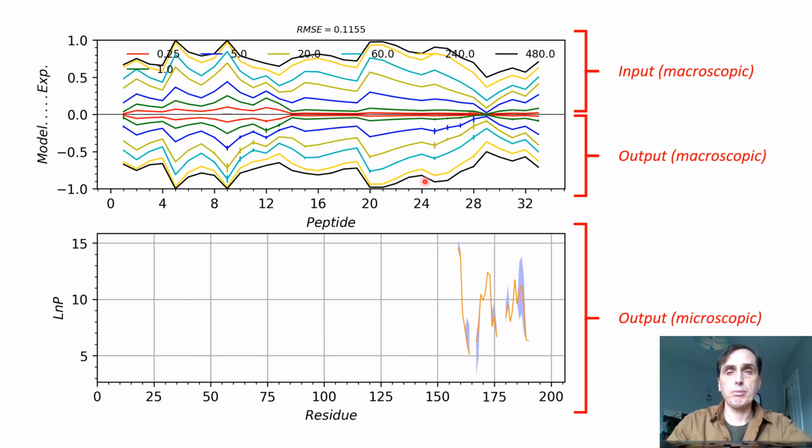So the main problem with optimization has always been how confident you can be in the results. And so this is a key part of HDXmodeller, which is the validation process. How we can evaluate error in this is going to be the subject of a later video.